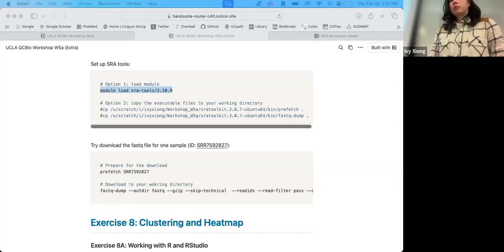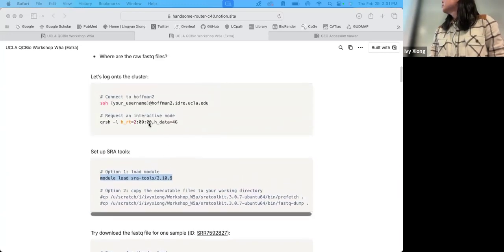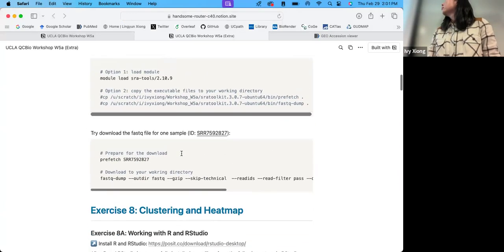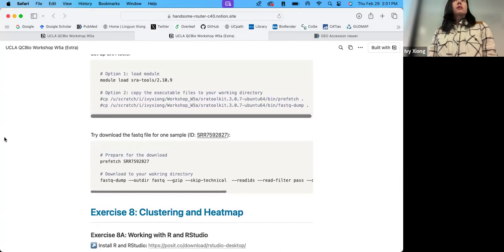Right. On this next one. Now press X. And then how do you refresh again? Yeah, mine's taking ages. Yeah, it's a raw read. That's why, when you're dealing with a lot of samples, it's quite time consuming.